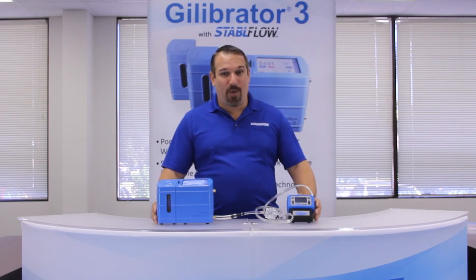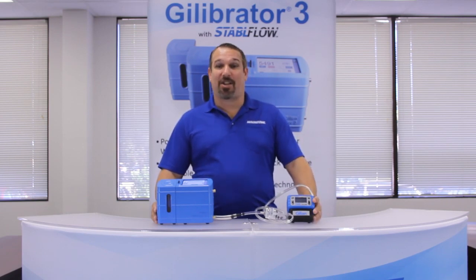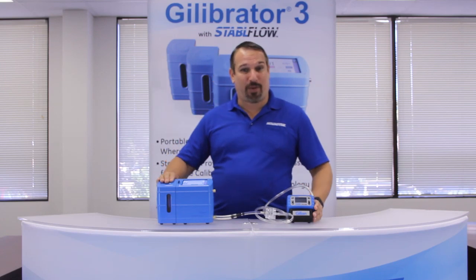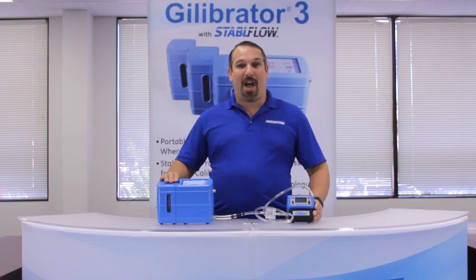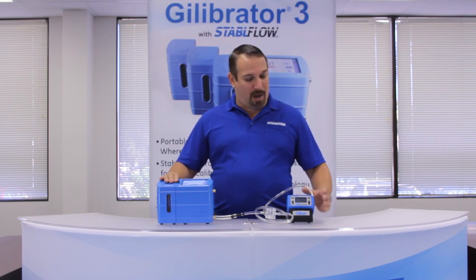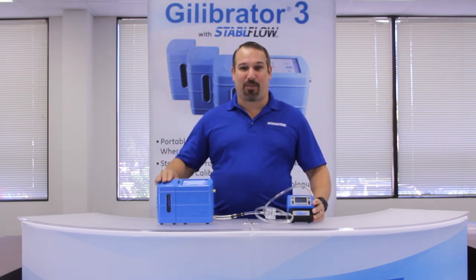Note: if you have an older GillAirPlus Pump, we recommend setting the communication mode to Gillibrator 2 and selecting Gillibrator 2 on your Gillibrator 3 device. However, if you have a newer GillAirPlus Pump, you may select the Gillibrator 3 mode on both the pump as well as the Gillibrator 3.